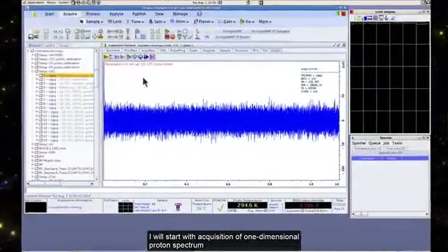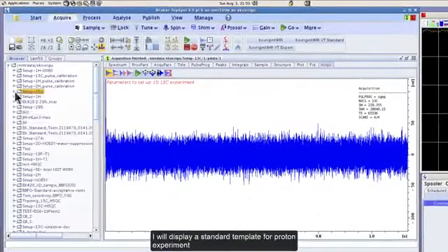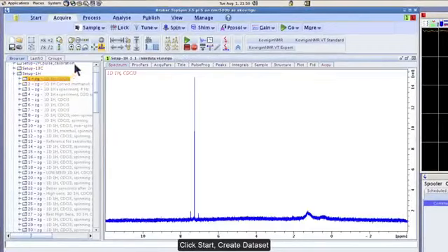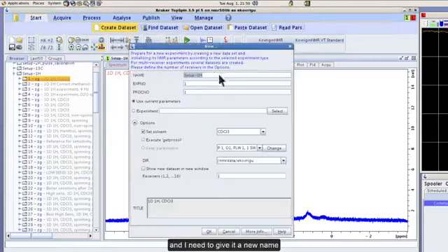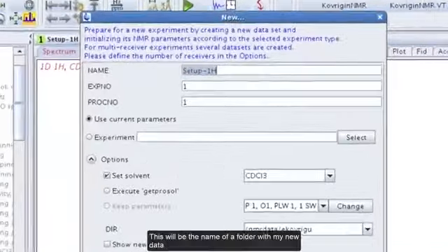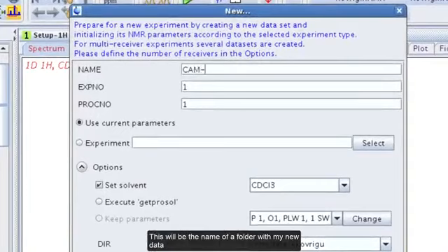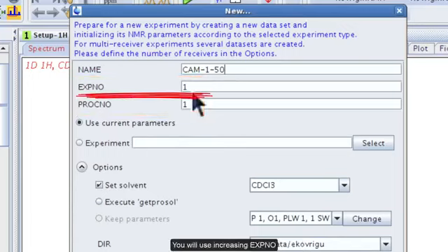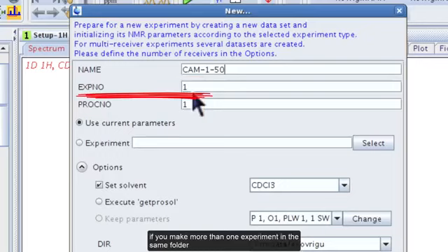2. Data processing, includes Fourier transformation, phase correction, baseline correction, integration, and peak picking. 3. Data analysis, tools for plotting, multiple spectrum comparison, and structure assignment. For automation, the IconNMR module allows for queuing samples and experiments to run unattended. 5. Database, stores all experimental data, parameters, and processing history for each sample.